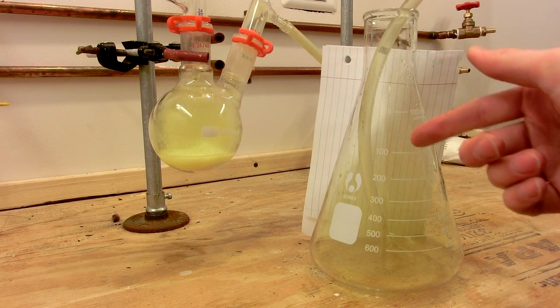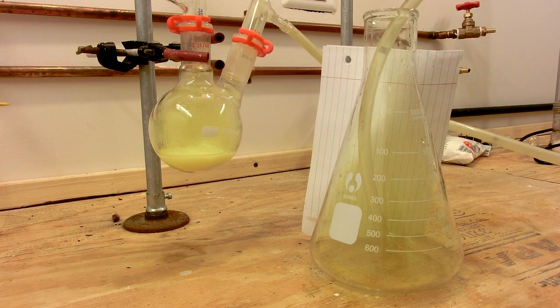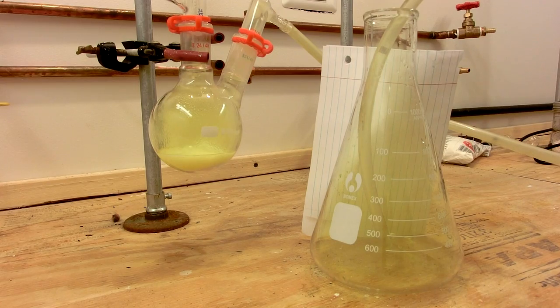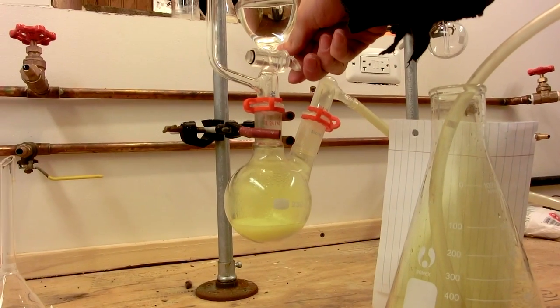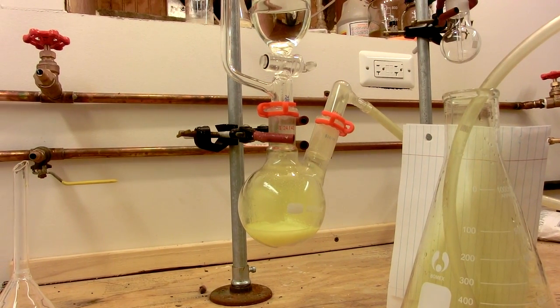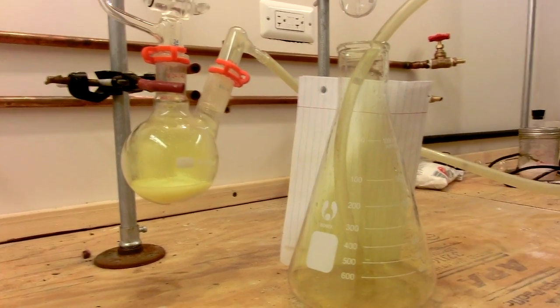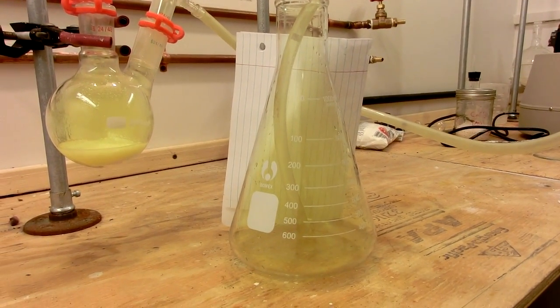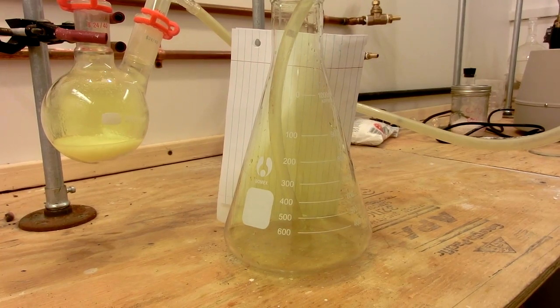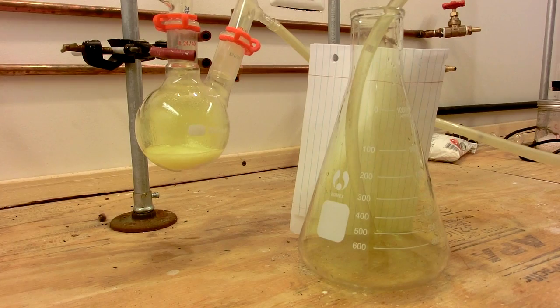And slowly but surely our flask fills with chlorine gas. I think we're just about reaching the top of that flask now, maybe a little longer. I am going to turn off the drip of hydrochloric acid to slow the chlorine generation gradually to a stop. And I will give this a minute to get to equilibrium before taking the tube out of the flask.